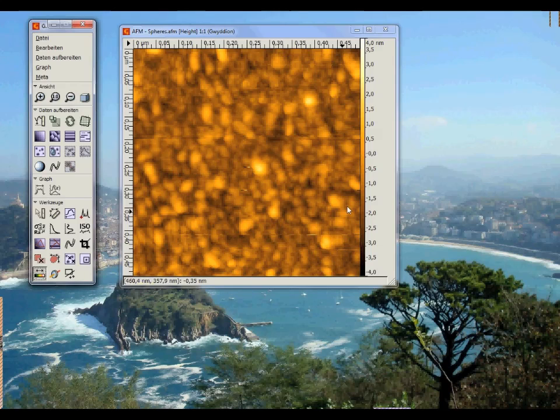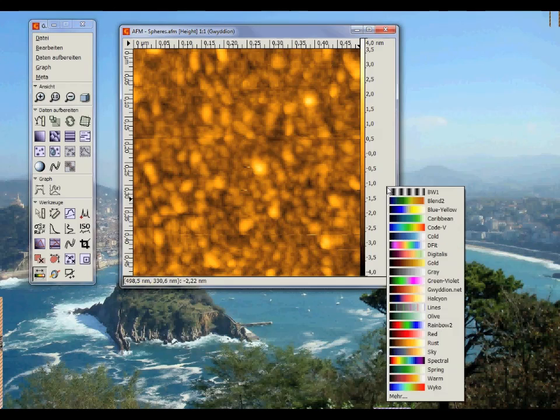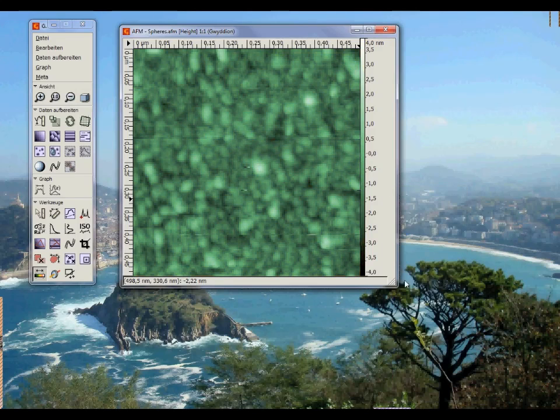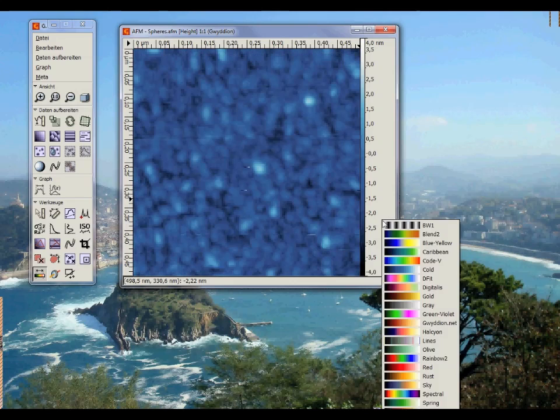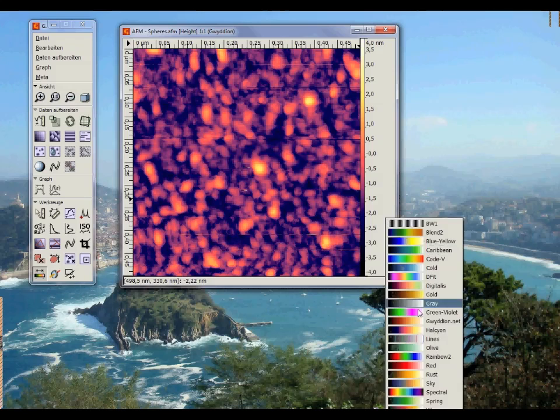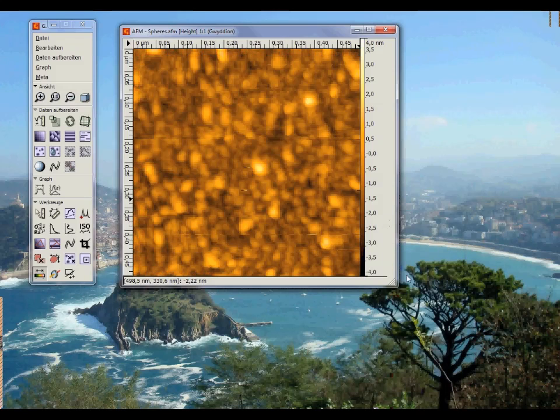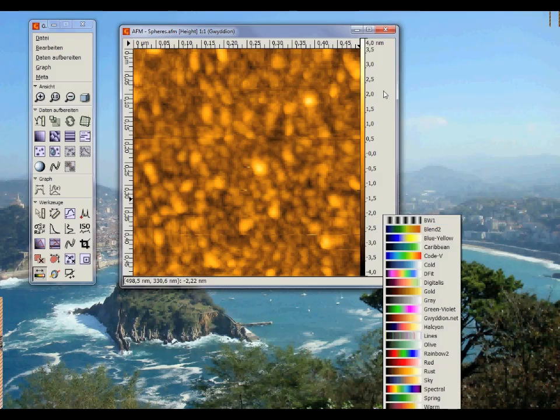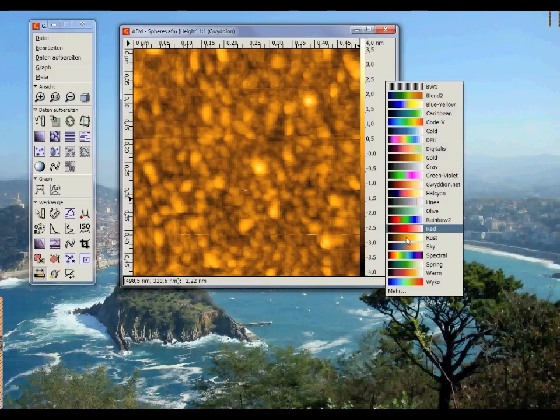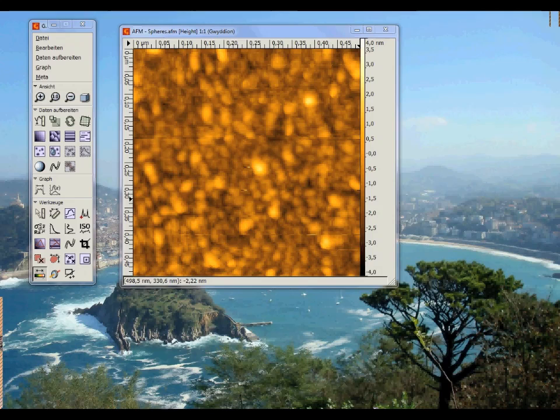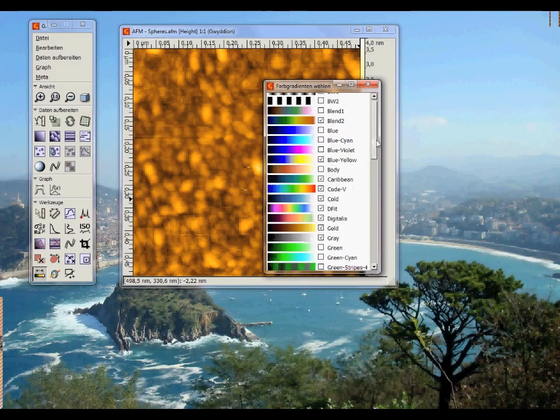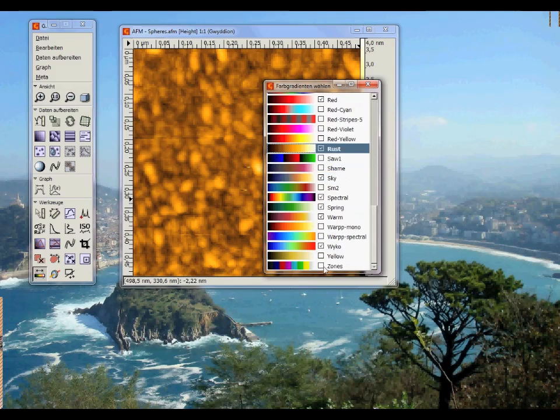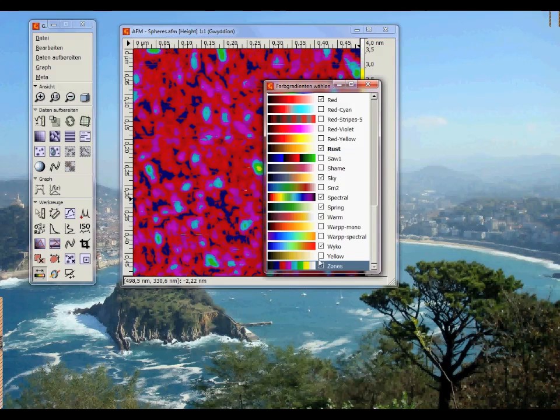Now I'll show you how to assign a color. For changing the color in GVIDION, you just right-click on the scale and choose any color you like. If you are writing a thesis or a paper and have different microscopy data such as AFM and SEM images, you would want to choose different colors to distinguish between them. A good trick is to open the More menu, then click on the color names and use your keyboard arrow keys to flick through all the different color schemes and select the one you like most.